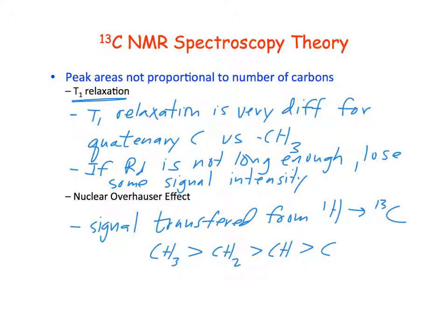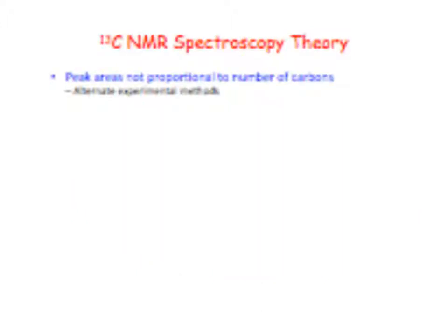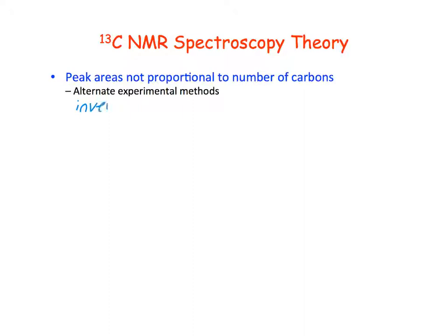All right, so we can run C13 experiments to allow us to integrate or things like that. So I'm going to show you two different ways. Okay, the first one is going to be called the inverse gated decoupling.